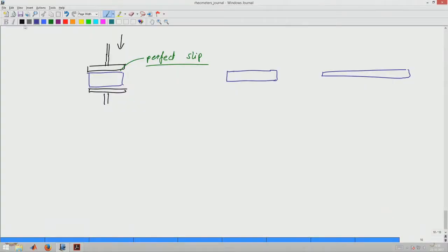So, this is an example of biaxial stretching being done through a rotational rheometer, but you can also have clamps and actually do the biaxial stretching. You can take a sample like this and you can have clamps at each and every end. So, you can clamp this side and pull, clamp this side and pull, clamp this side and pull and clamp this side and pull.